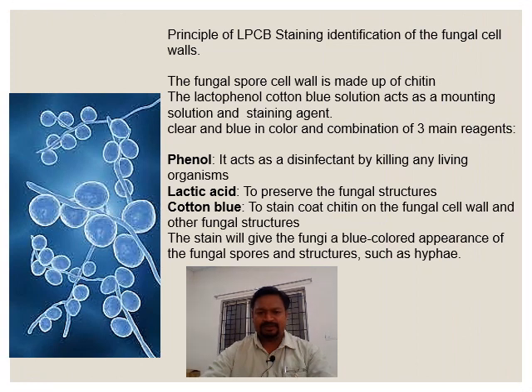The principle of lactophenol cotton blue staining: the fungal spore cell wall is made up of chitin. The lactophenol cotton blue solution acts as a mounting solution and staining agent. It is clear and blue in color, with three main reagents.